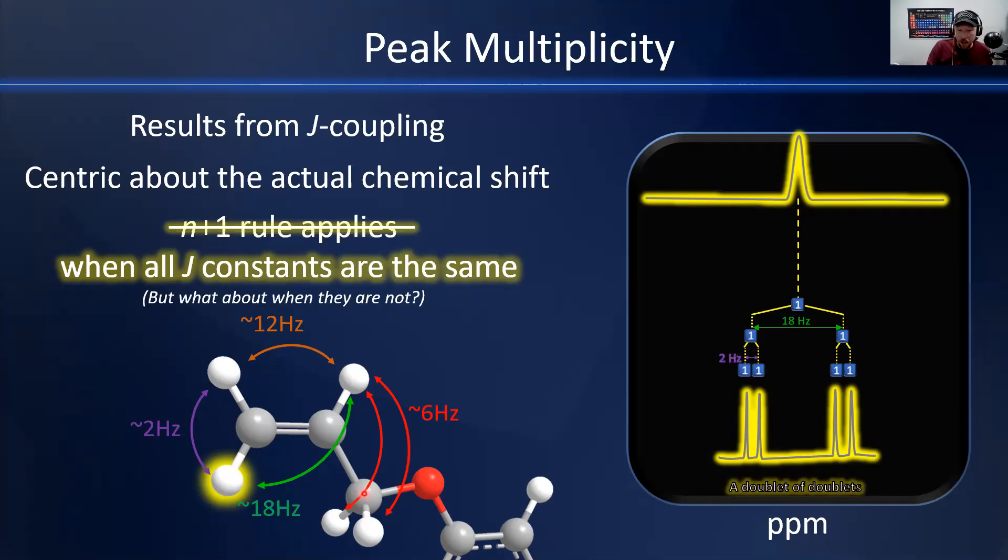We've got our doublet of doublets there. There are some others here, and I would challenge you to figure out what the multiplicities of all of these hydrogens in the vinyl group should be. Because they're unusual, and in that respect, they're easy to find and identify. They give us a good firm foothold during our NMR assignments if we can locate them. In particular, this interior vinyl hydrogen right there—that one has got a really wild multiplet. Try this exercise for yourself. Get a piece of graph paper and split your resonance by 6, by 12, by 18, by 6, and so on, until you've accounted for all of these couplings and see what kind of multiplet you expect to see in your NMR spectrum.